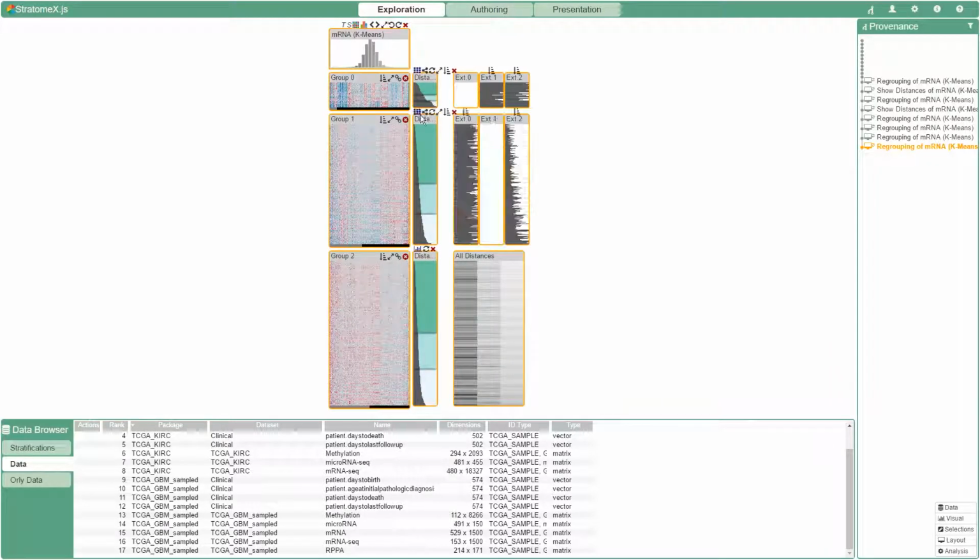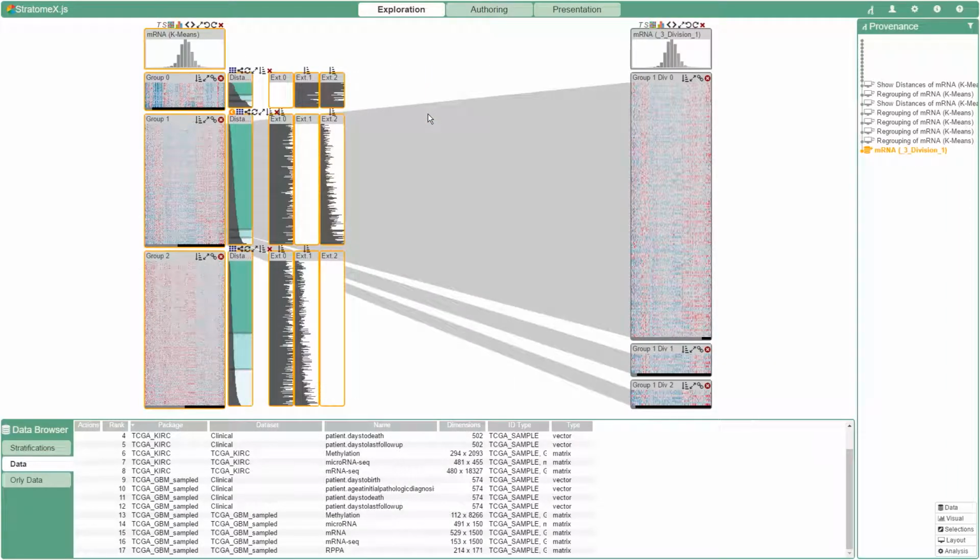We can refine clusters based on the information of the distance views. They provide sliders dividing the clusters into 3 different regions: those that fit well, those that fit okay, and those that only fit poorly. We can refine these thresholds independently. Once we found good thresholds, we can split the cluster. The new clusters are shown in a new column.